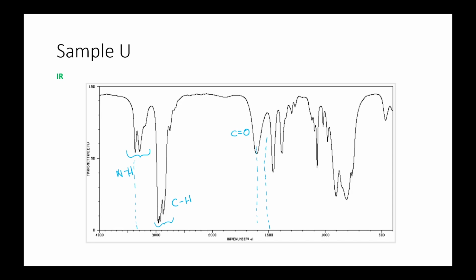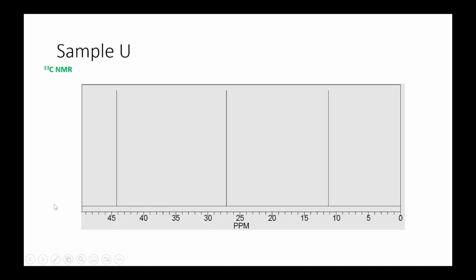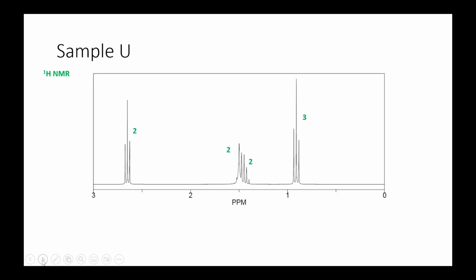And so the next thing will be to see if we do have an oxygen in our mass spectrum. So keep in mind here, we're not 100% sure about this one here. We've identified it as just outside the carbonyl region, but we'll keep it in mind. Next, we have a look at our carbon-13 NMR, and we can see we have three peaks of the same size. So we're going to tentatively say that maybe we have three carbons in our molecular formula.